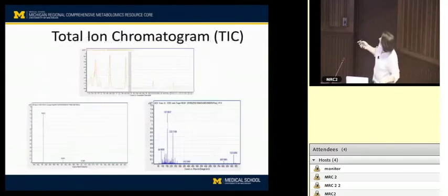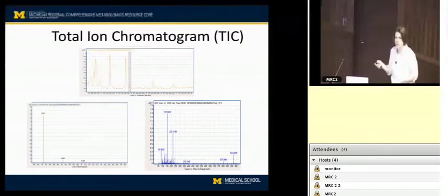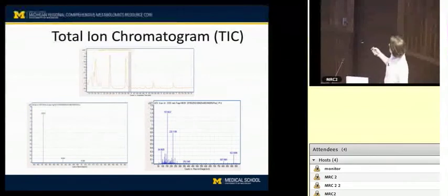All right, going back. This is maybe very basic for some of you, but I just want to make sure that everybody understands what we're talking about. So yesterday Charles and I talked about what an extracted ion chromatogram was. That's where you are looking at a particular mass that's been detected in the mass spectrometer, and you're saying within a very tight mass window, where am I seeing this peak? And if your mass accuracy is good enough, if you can tighten that window down to 1 or 2 ppm, you may only see a single place in the chromatogram where that peak comes out.